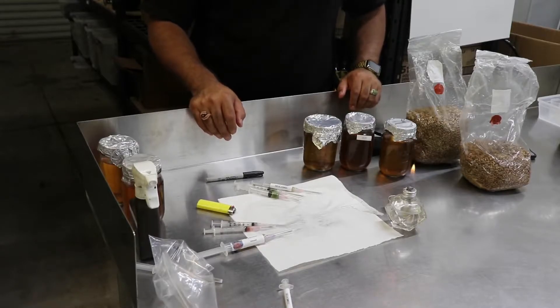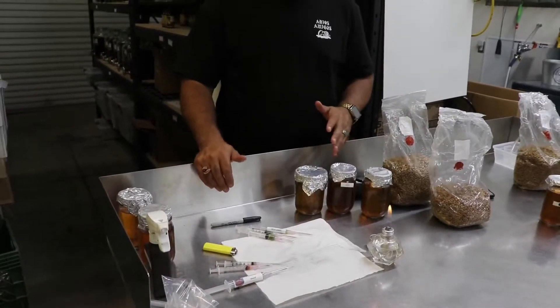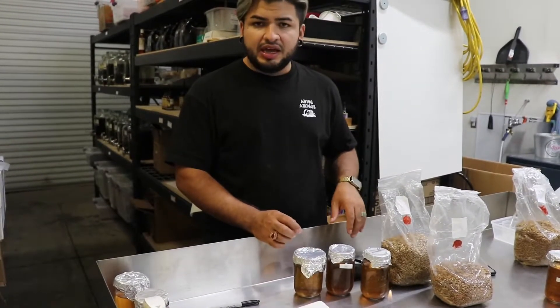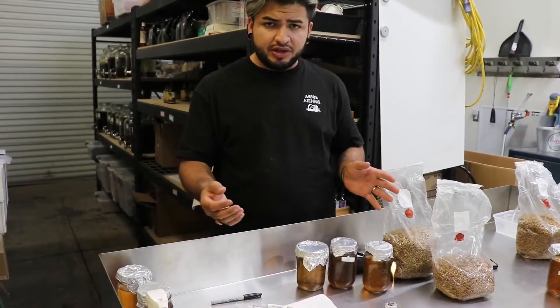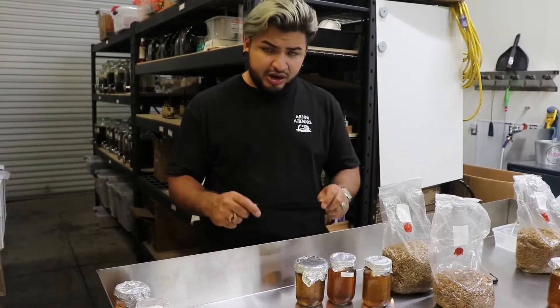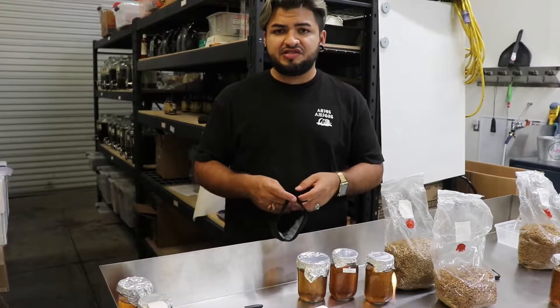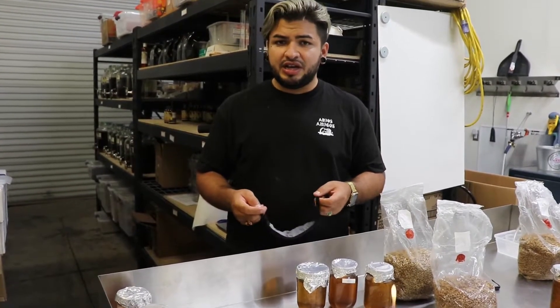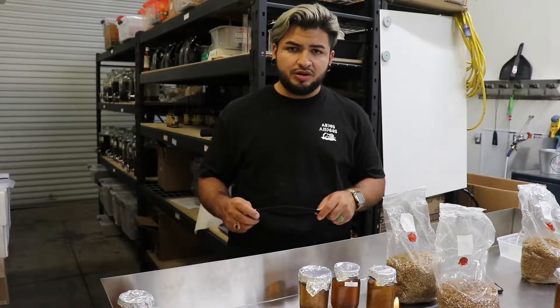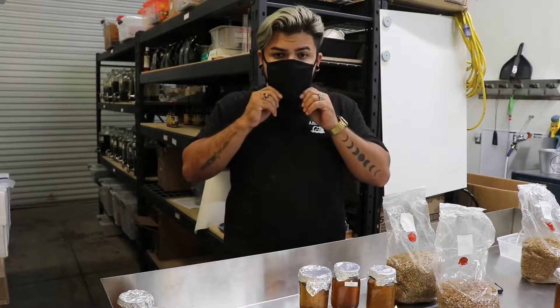Usually when you're working with mushrooms you want to wear gloves or long sleeve shirts, but in this case we're only working with culture and spawn inside sterilized containers, so we don't need to worry about that. One thing you do want to worry about always is wearing a mask. I've been wearing masks before the pandemic — any mushroom grower will wear a mask when working with mushrooms because your saliva carries a lot of bacteria, and even just breathing over something can contaminate your mushroom product. So always wear a mask.